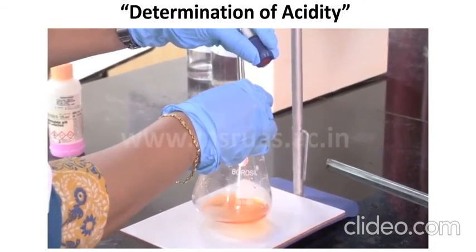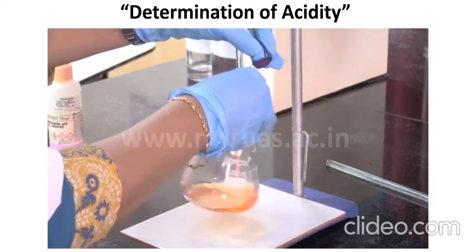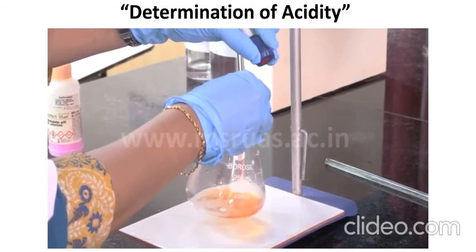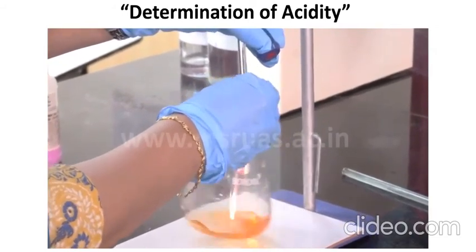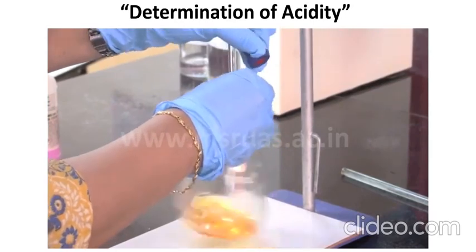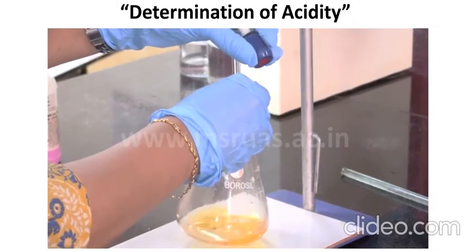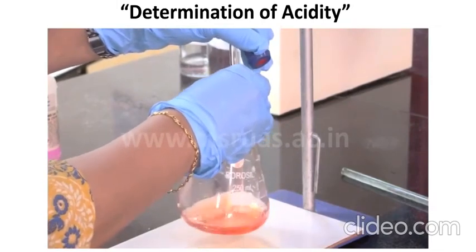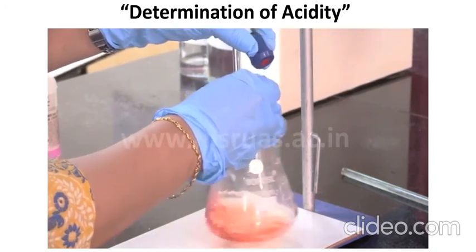Now titrate again, that is continue the titration. Now the color has changed.